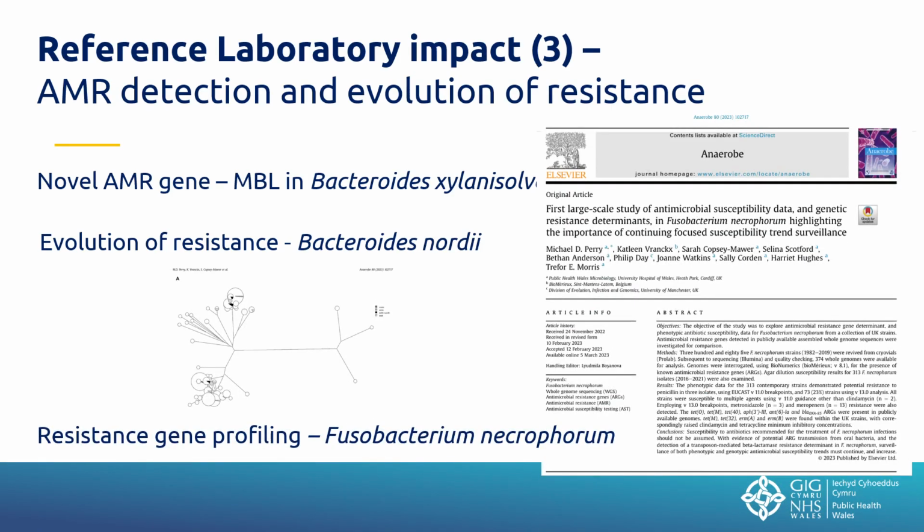And then the third publication here, as an example, is one from Dr. Michael Perry from the Anaerobe Reference Unit, and he has performed the first large-scale study of almost 400 strains of Fusobacterium necrophorum, and concluded that continued surveillance is necessary, as we discovered a transposon-mediated beta-lactamase resistance determinant in those strains.